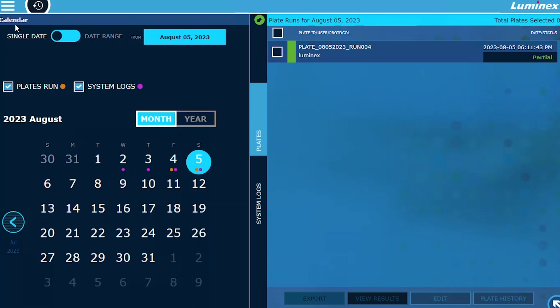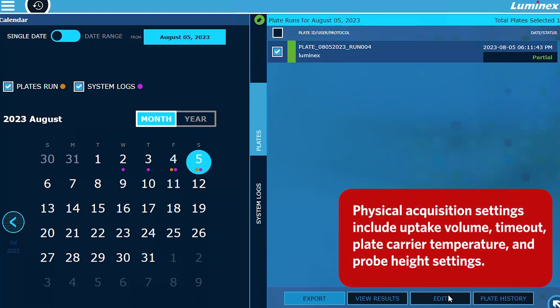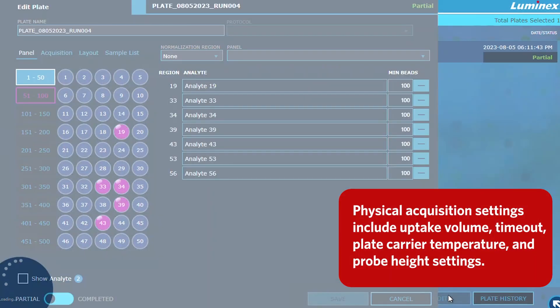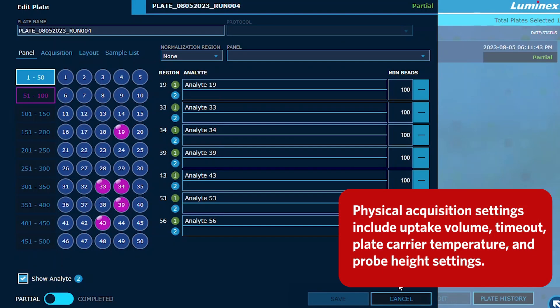Simply navigate to the History page, select the plate you want to modify, and make the necessary adjustments under the appropriate tabs. Please note that physical acquisition settings cannot be changed using Edit.